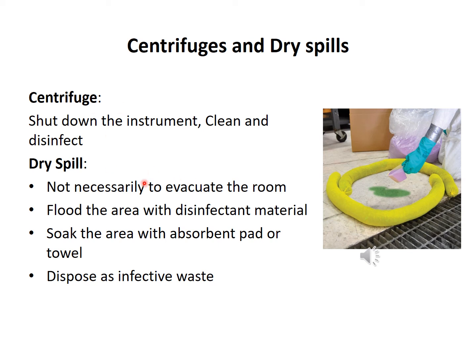Sometimes it is very common that a dry spillage or some wet spillage happens onto the equipment we are working with, especially centrifuges or other small instruments. So this is really important. You just stop the equipment and clean and disinfect, because this is very minor. For example, I have some tubes and I'm doing a centrifuge experiment, and due to overflow, some imbalance or something happens, and it can contaminate the centrifuge.